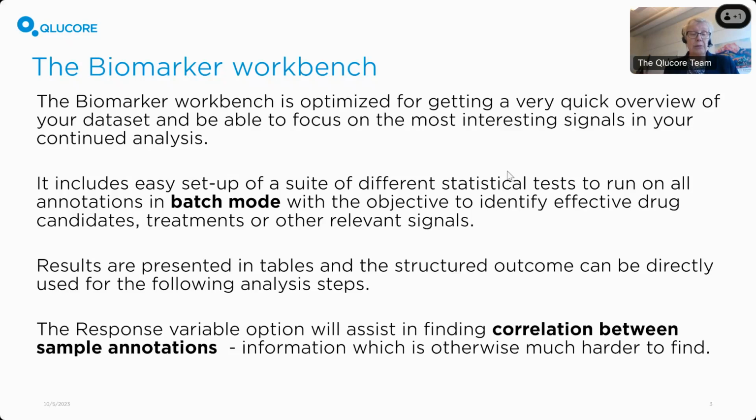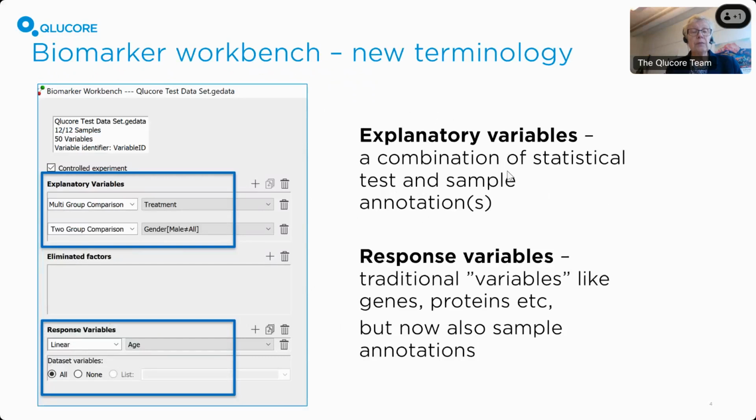And then we also have something called response variables, which will assist you in finding correlation between annotations, which is normally quite hard to find with other tools. So we'll show you how you can do that.